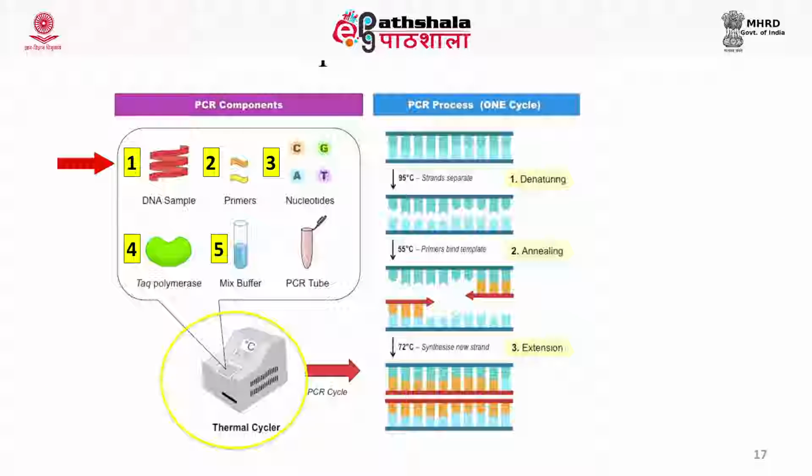The first component is the DNA sample. The DNA sample has the template DNA. The second component are the primers. These primers are specifically designed towards the flanking region of your template DNA. The third component are the nucleotides. These are the building blocks for DNA amplification. The fourth and very important component is Taq DNA polymerase. The fifth component is the mix of the buffer and divalent cations useful for the action of Taq polymerase.